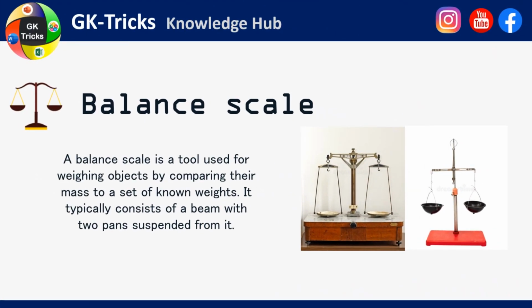Balance scale. A balance scale is a tool used for weighing objects by comparing their mass to a set of known weights. It typically consists of a beam with two pans suspended from it.